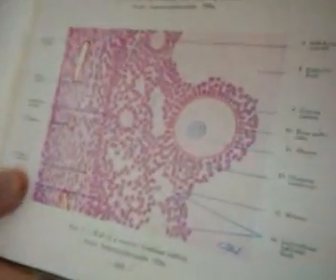And then I'll have a good one where you see this darker line, usually a little darker, called the zona pellucida. Zona pellucida. Little thin line? Yes. The zona pellucida. That could be asked on this. And see, it shows up on this one as a real thin line, a little thin purple right there. Zona pellucida. Okay? And so there it is.